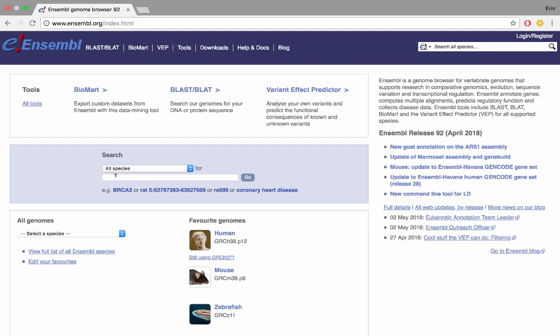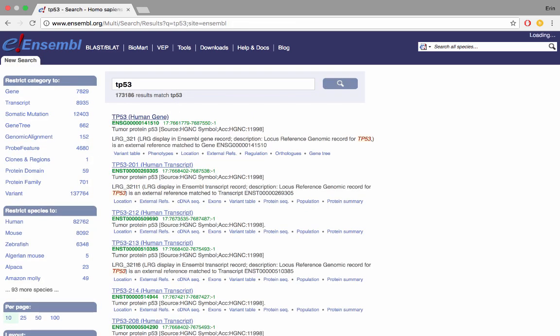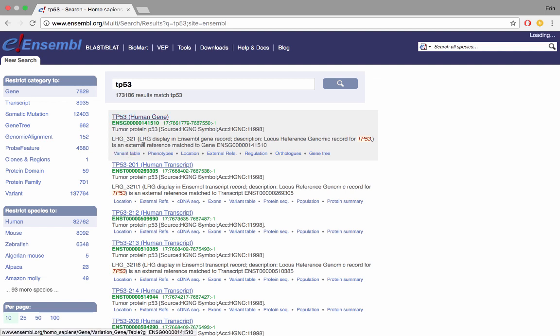Here I am on the Ensembl homepage, Ensembl.org. We have the header at the top with quick links to useful tools such as the VEP or BioMart, which are covered in other tutorials on our YouTube channel, as well as having documentation. If you're stuck at any point, you can access this from any page in Ensembl. We're going to be looking at the gene TP53, so I'm going to type that into the search box, the main one here in the center of the screen. I haven't specified a species, but as human is the most popular species in Ensembl, it comes up at the top. If I click on the gene name here, it'll take me straight to the gene tab.